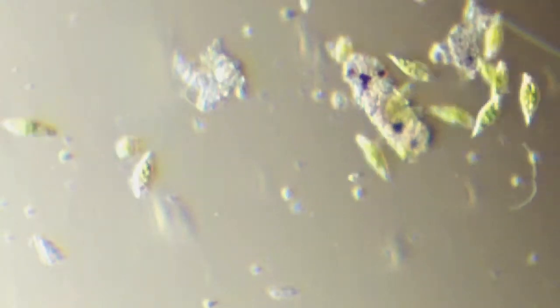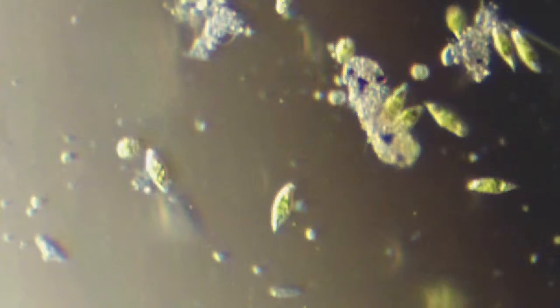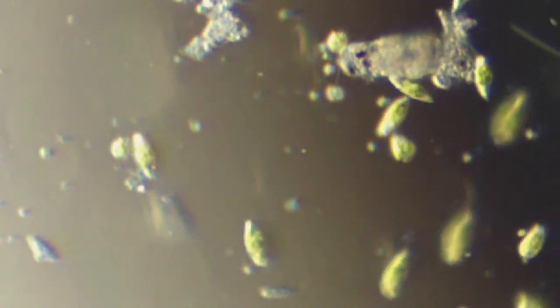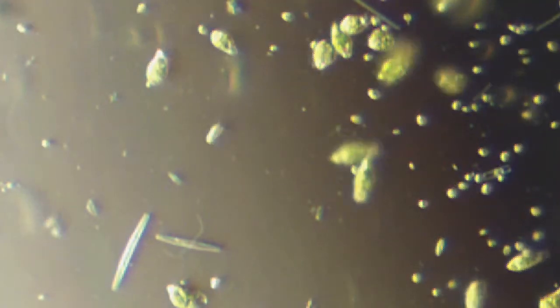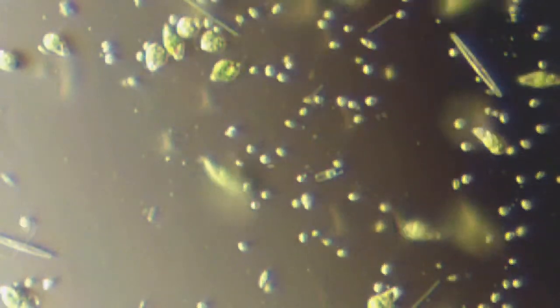So nice, let's go back a level because that's too much power. And now I've got a little bit of oblique lighting so you get some 3D qualities here. There's some oblique lighting for you. Those guys are getting all beaten up by that nematode. Look at that. It's going bonkers. You guys have seen nematodes before on my stream, so I'm not going to hang out too much with the nematode. Yeah, those might be chlorella. Very small.